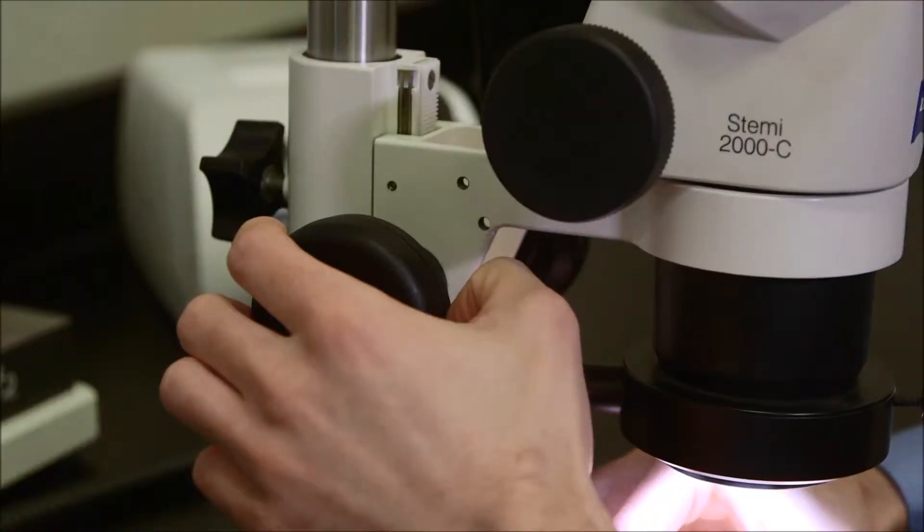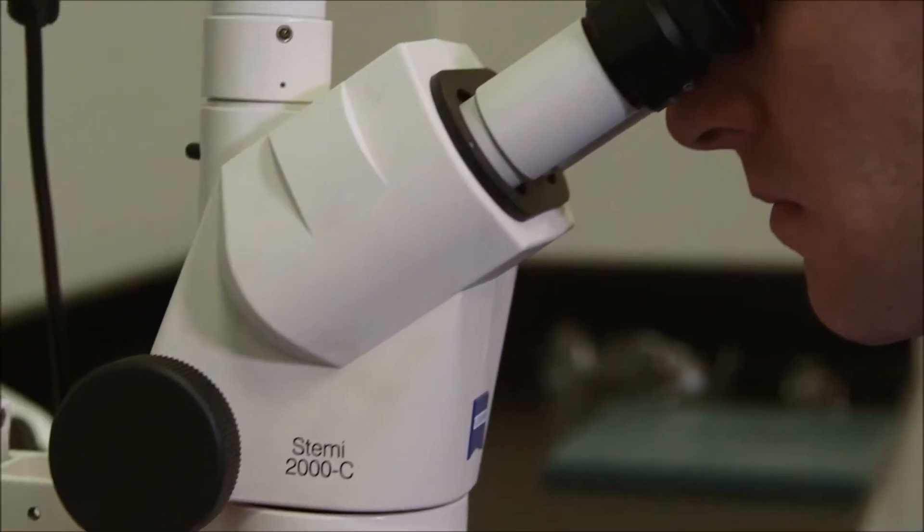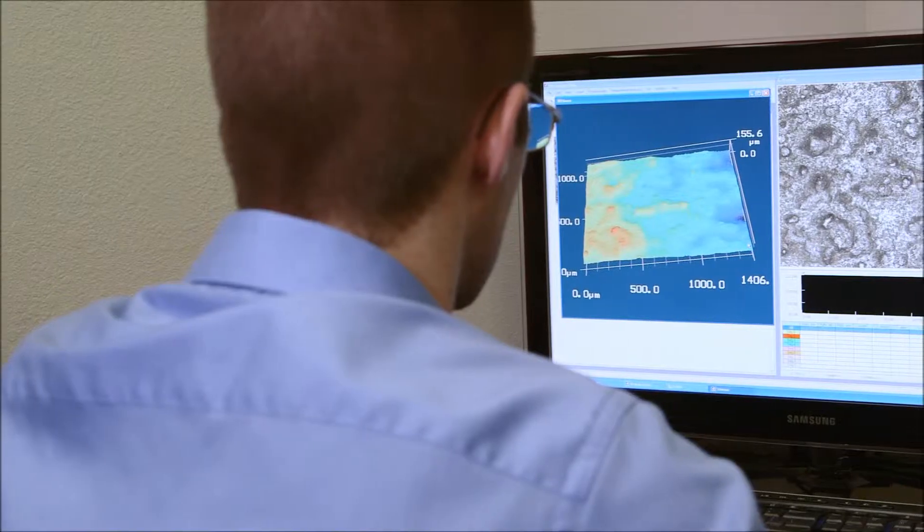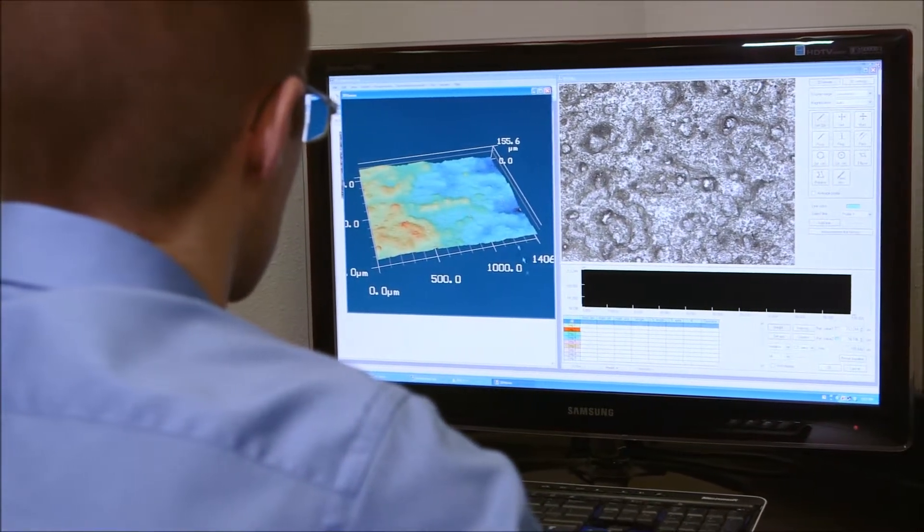The new lab really has unmatched capability across the spectrum of materials analysis. We've been told by a number of people that we've brought through that they haven't seen this collection of equipment, this capability in one lab ever. So we're really proud of it.